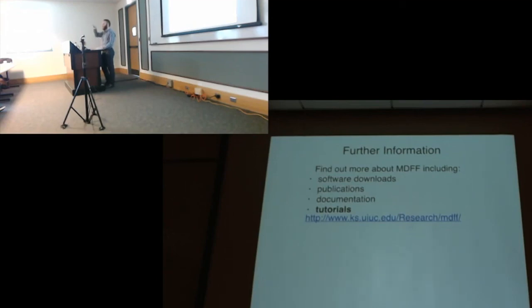Just because, if you look at the last frame, it's possible that the sidechain wiggled a little bit one way and isn't in the actual minimum anymore. And so you can look at the ensemble of structures, minimize it. I mean, they're going to be very similar, but you're not getting the best structure at the very end.